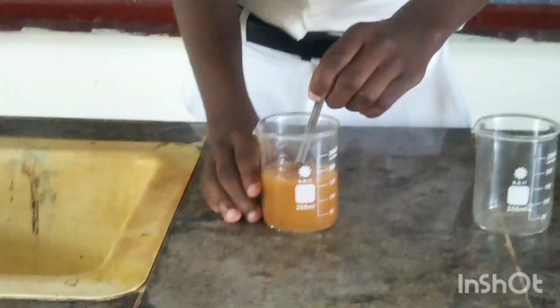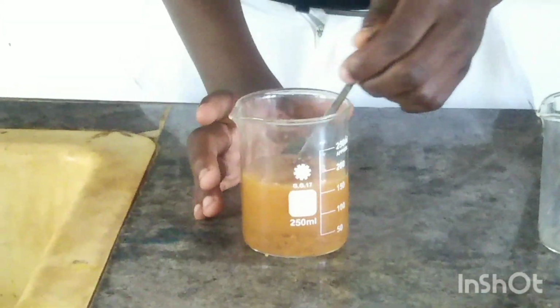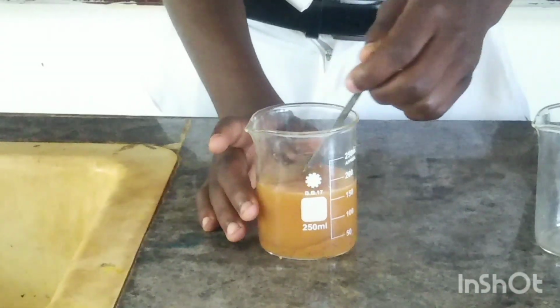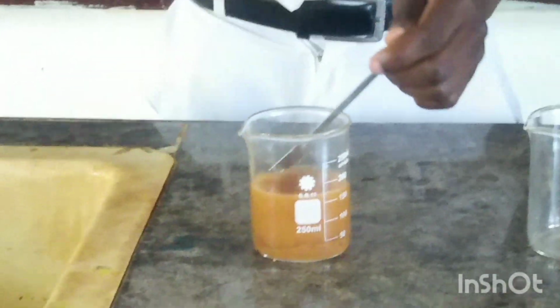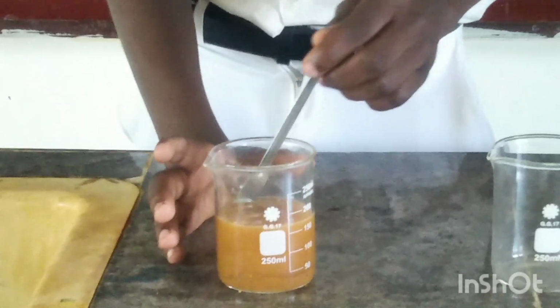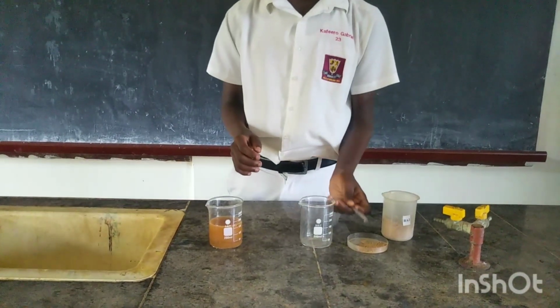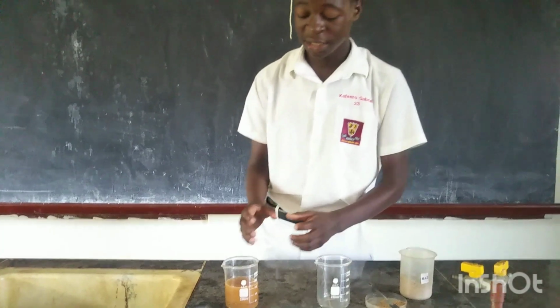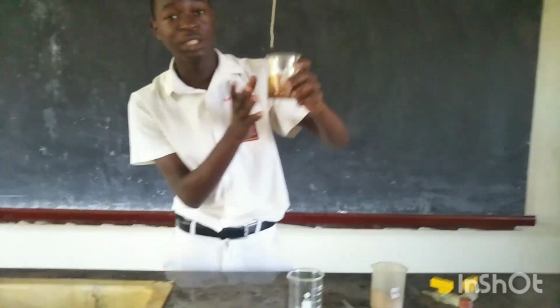But remember, these two things cannot be mixed permanently, or they cannot dissolve into each other. So we may not get a uniform mixture of the sand and water, meaning that some particles of sand will remain in the beaker. So after mixing, I need to leave it for a few minutes for the sand that I added to the water to decant.